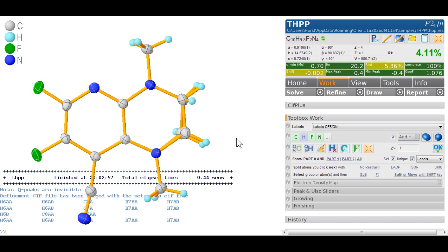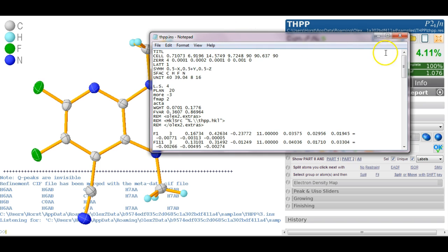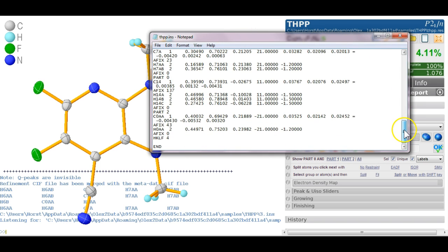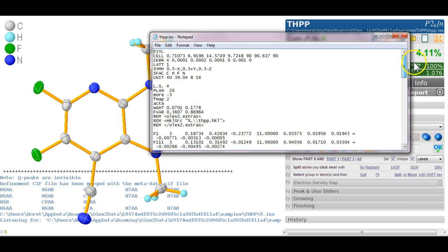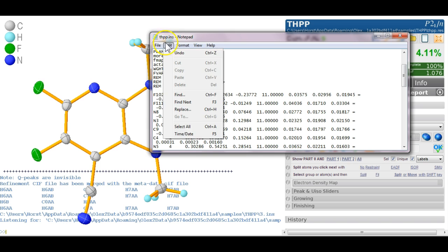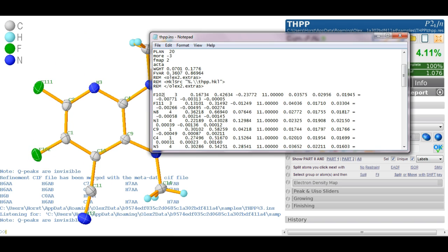Again there's no need to edit those files at all. If you really want the INS file what you can do you can type edit space ins. So this now will generate the INS file for you as it would be generated for ShellX refinement. You might notice it says listening for this here so now you can actually edit live here and you can say okay I'm going to call this f102 and when you save that and this is automatically reloaded. So there's now f102.